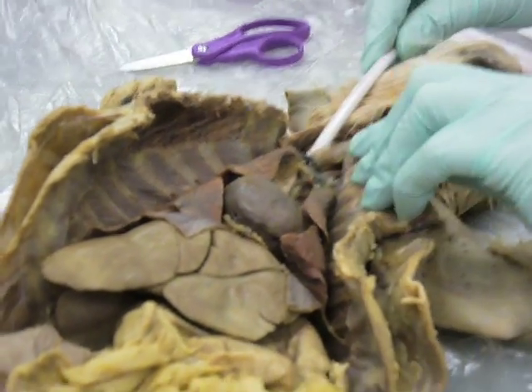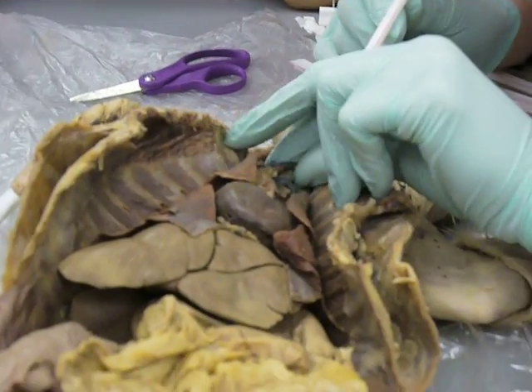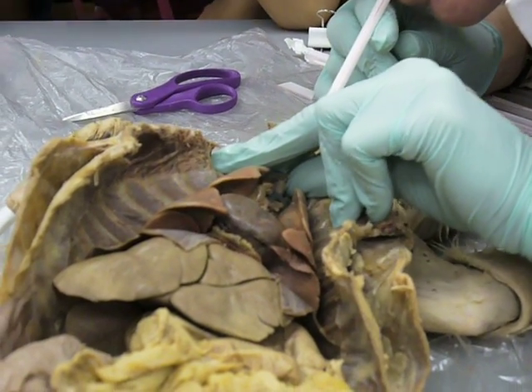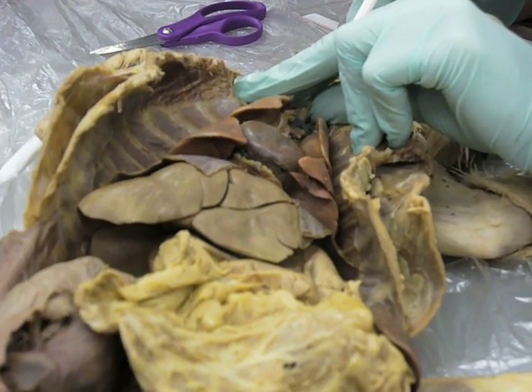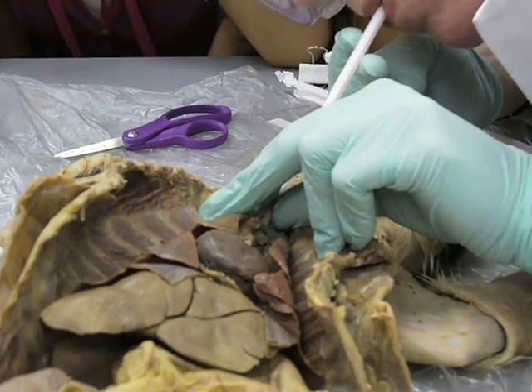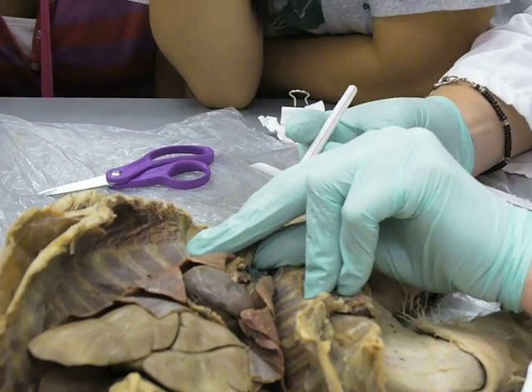I stuck a straw down through Winston's trachea. Let's see if I can get them to inflate — they were inflating last time I did this. Oh my gosh, cool! It's alive! It's so cool! Oh my gosh. Let me see if I can get a really good one. But you get the idea.